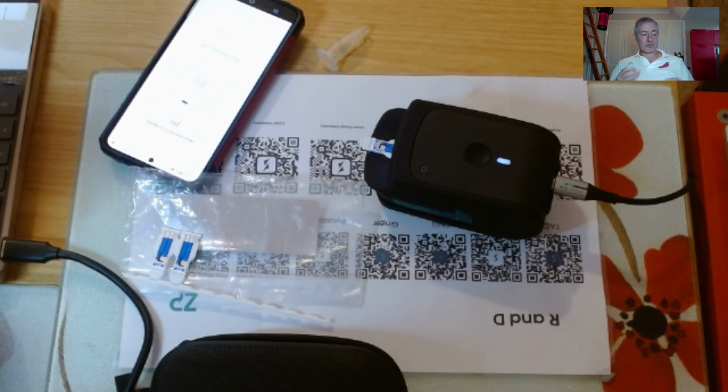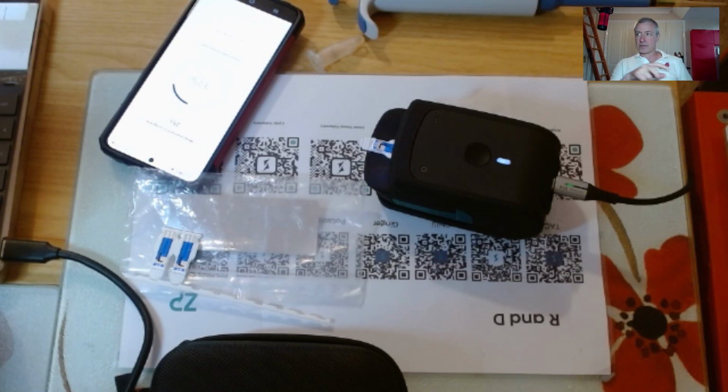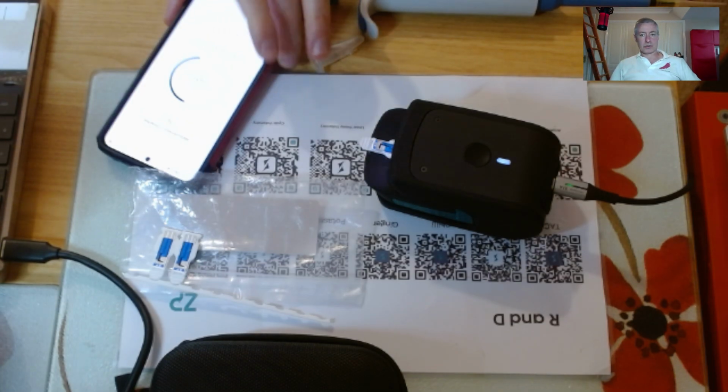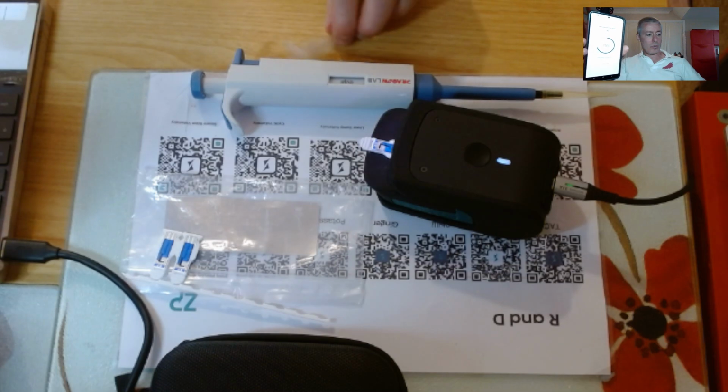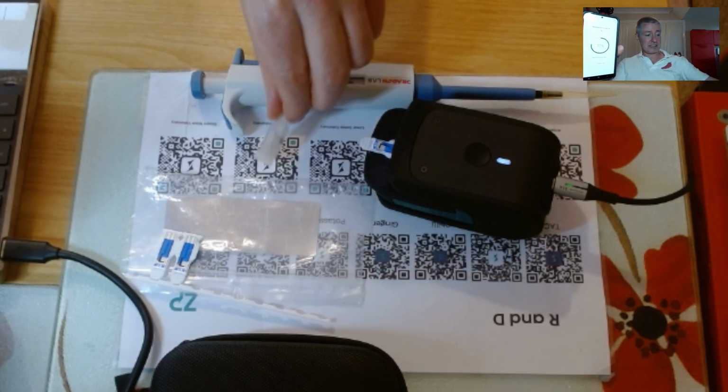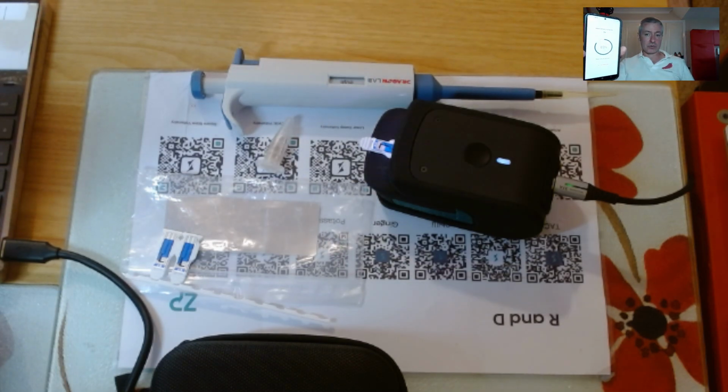Okay, so that's running now because I just want to get results on my phone. I'll show the results on my phone. Then I'm going to show you the results in the cloud, and I'm then going to show you a quick spreadsheet calculation. So at the moment, there's a progress bar on this. It's progressing. I put 50 microliters onto the sensor. When the sensor's done its work, the meter will give the results to the phone, and I'll show you a few more things.